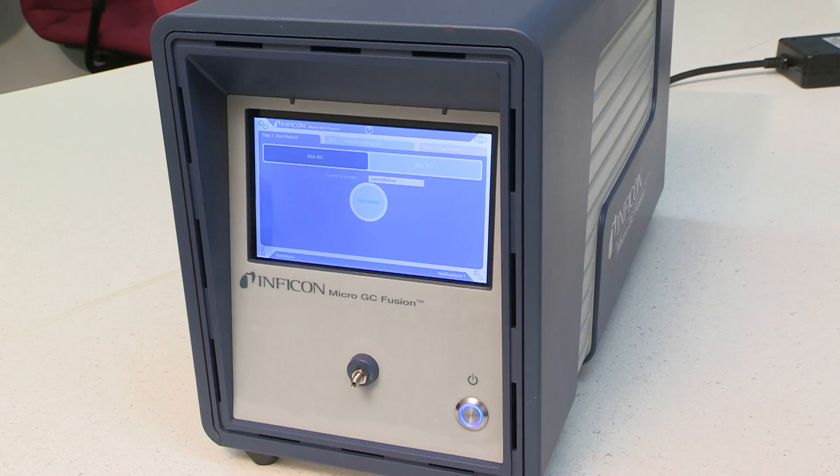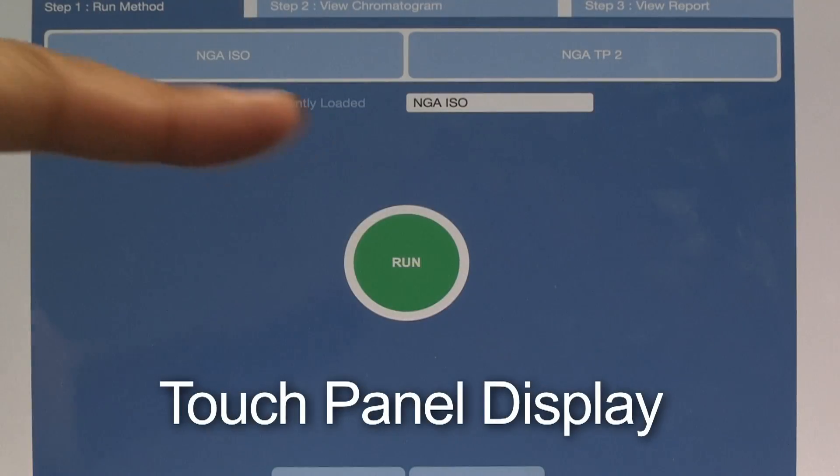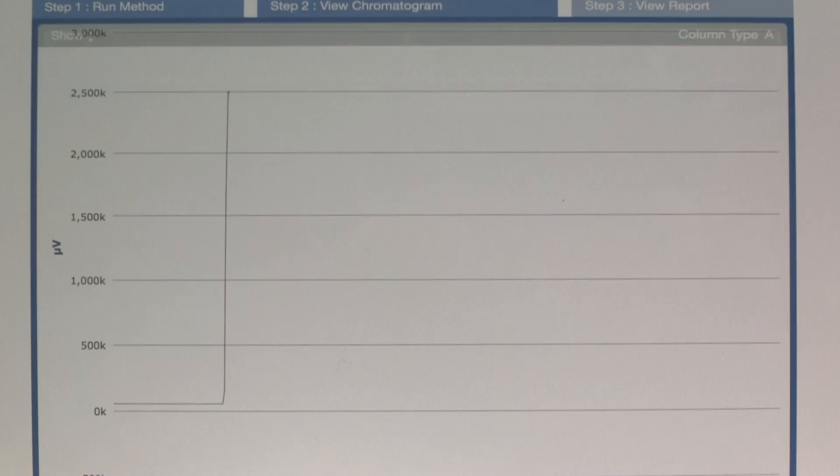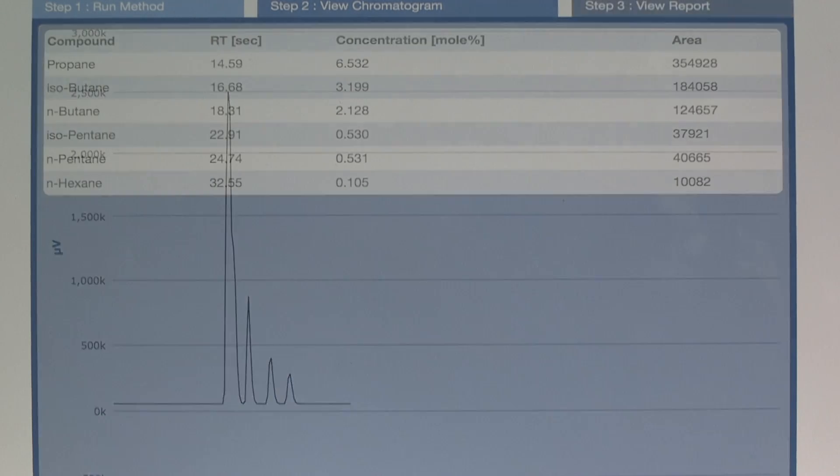Fusion is designed to make GC technology user friendly. It is equipped with a touch panel display, allowing users to select a predefined method, run a sample and view the results.